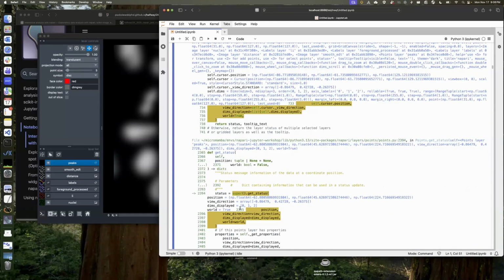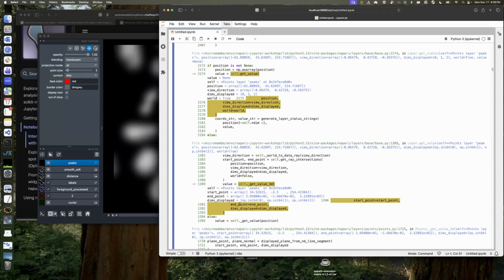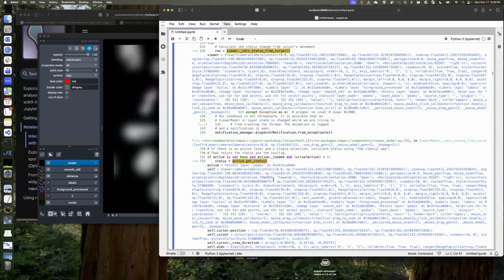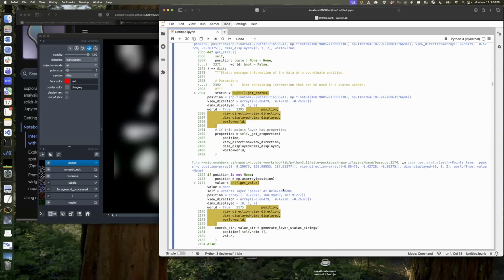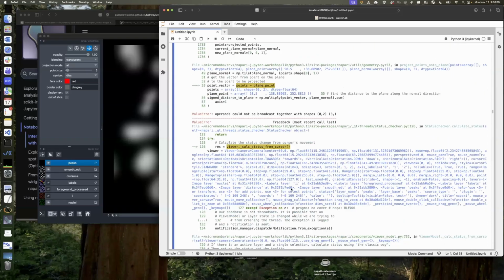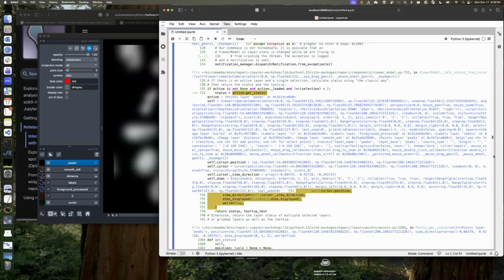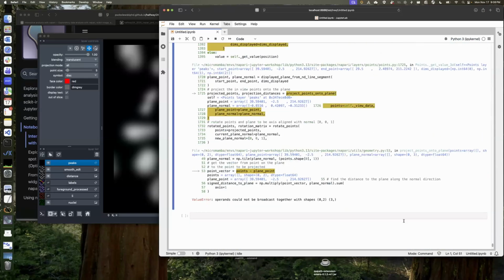I'm just going to scroll past all this error message. I'm not going to try to figure out why it's not working right now. It doesn't like something. There's probably something that's 2D and something that's 3D simultaneously. And wow, this is a really long traceback. All right, scroll. Really amazing.